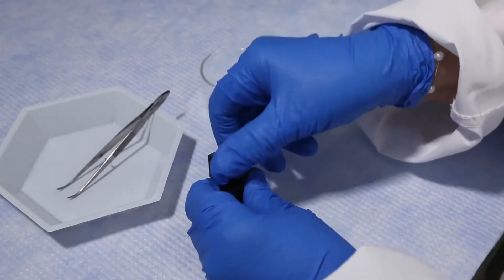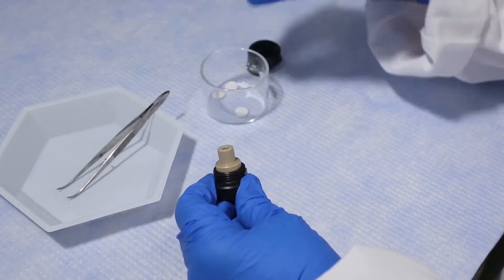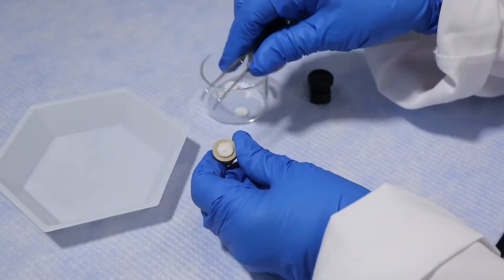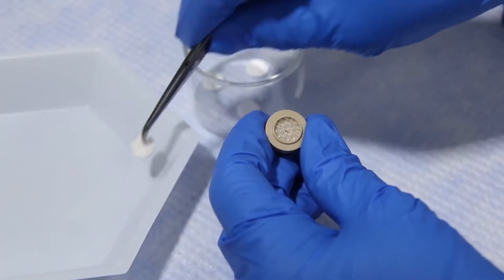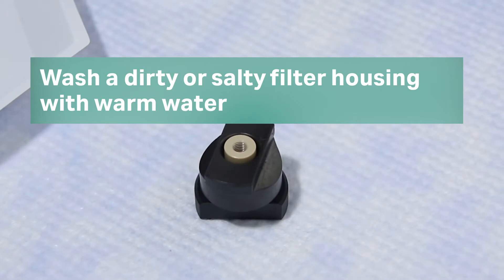Unscrew the filter housing to expose the filter. Using a forceps or probe, remove the old filter. If the filter housing is dirty or has salt crystals on it, wash it with warm water.